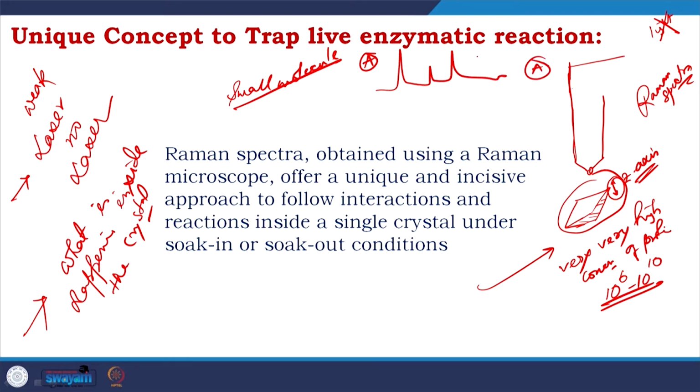Now, you set everything, you set a protein crystal which is affecting A. If A would be changing to A1, A2, there is change of bond, there would be change of spectra. So, here you align and this is different, you understand.